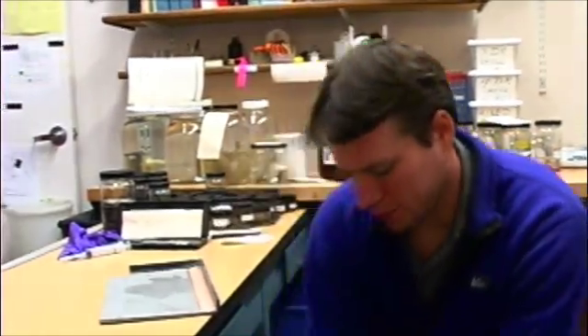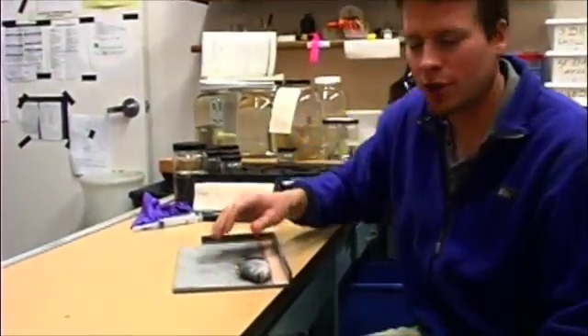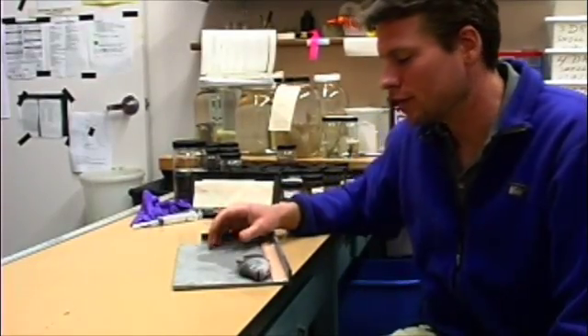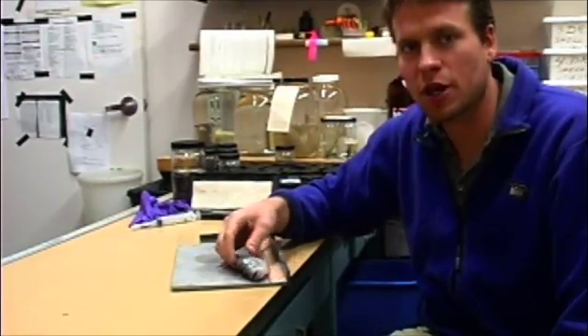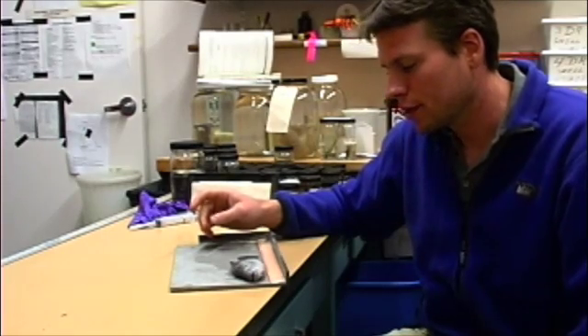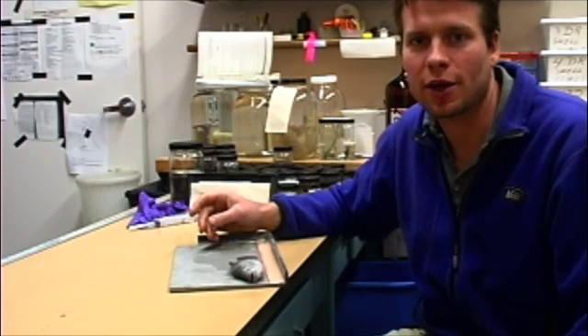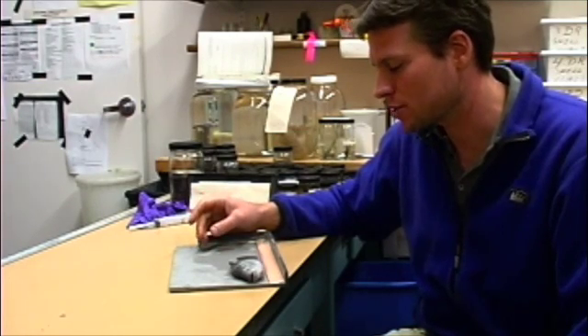So here I have a fish in this bucket. This is a fish that was used in the breeding program here at the museum, part of Dean's research. This is the Cuatro Cienegas cichlid called Herichthys minckleyi. This fish has been anesthetized using clove oil. Clove oil is oil from cloves — you can get it at a health store and it's a very effective anesthetic for fish.